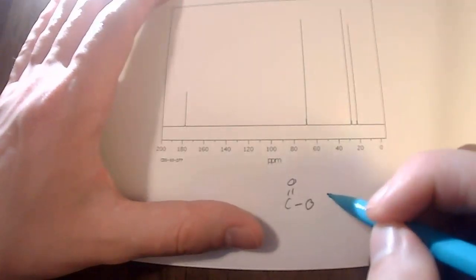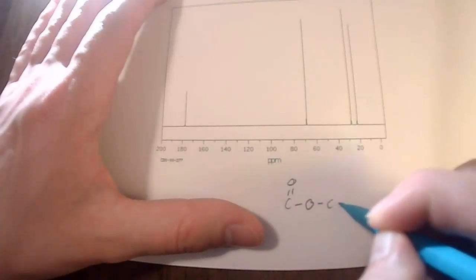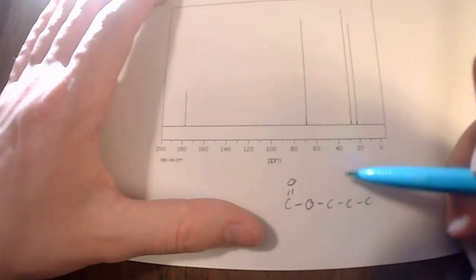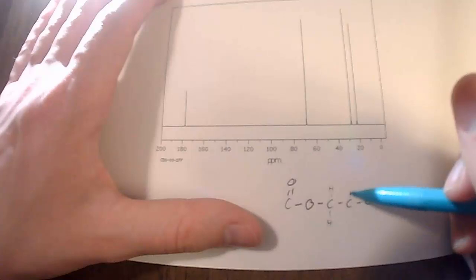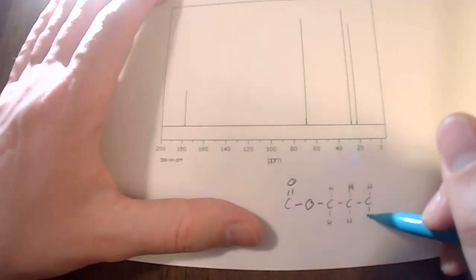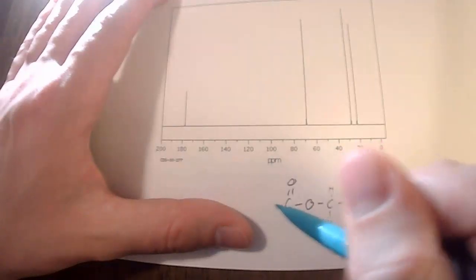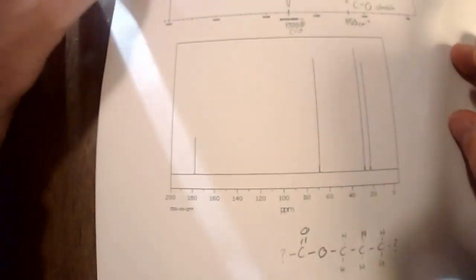And then for all we know, to cover the other 3 carbons not present, carbon, carbon, carbon, we'll assume with this that we have hydrogens present, but we only have 6 hydrogens, so we don't really know what's going on here, further indicating that it might be a ring, but let's also find out.